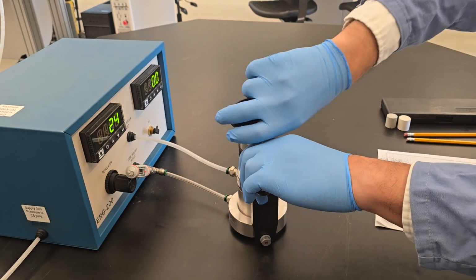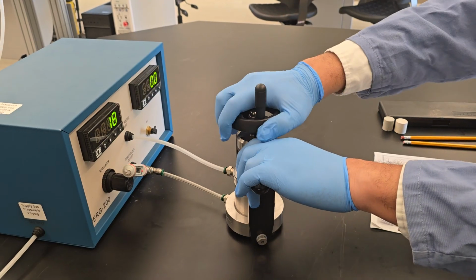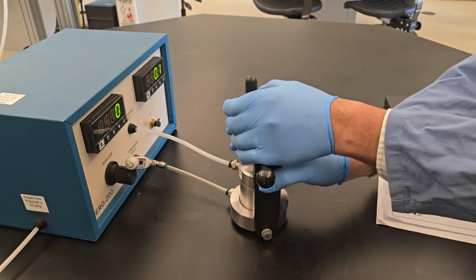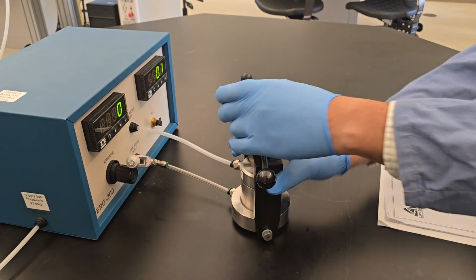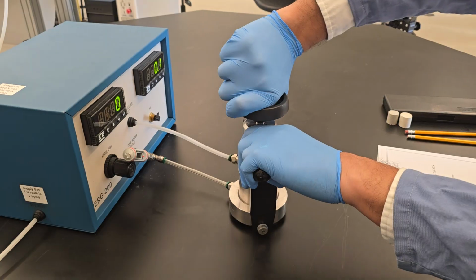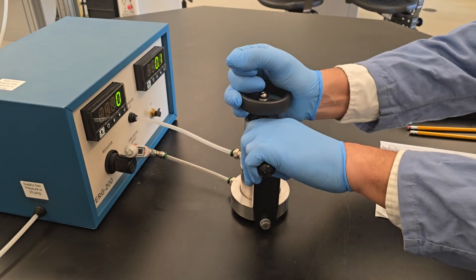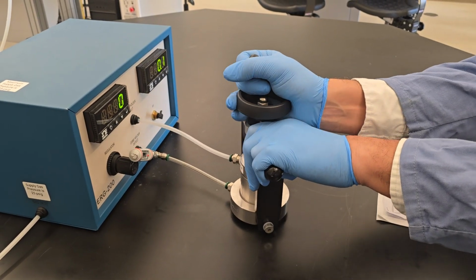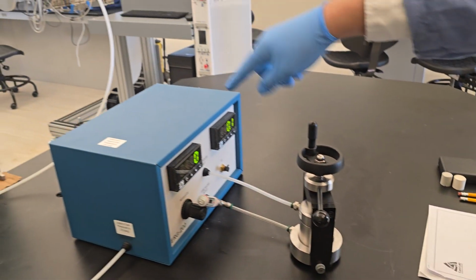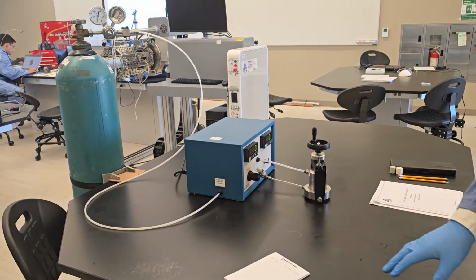So this one we use nitrogen gas for, so any compressed air will be fine with it. Well, the good thing about the nitrogen, it's easier for us to determine the viscosity of the nitrogen, which is needed for the calculation. So I tighten it well. That's very tight, I would say. Okay, then we plug the equipment to the electricity already.